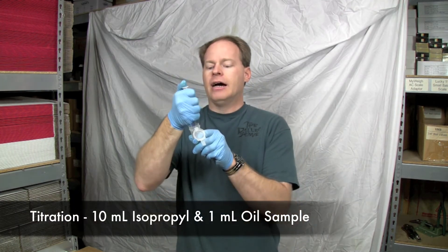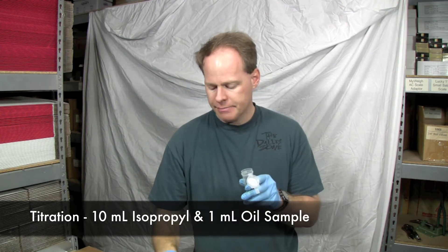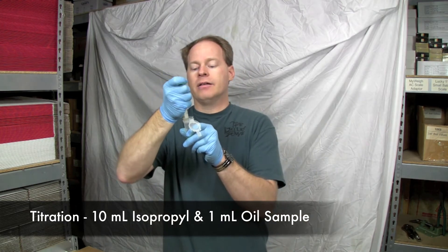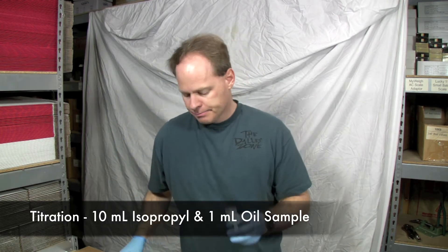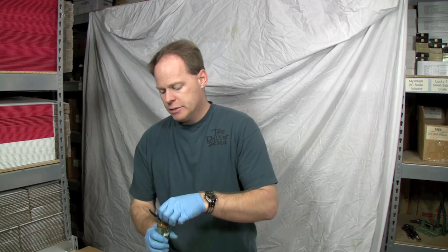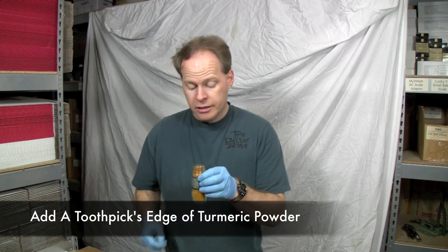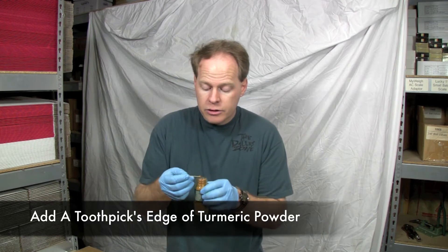Let's show you how it's done. We're going to do just a normal titration. 10 milliliters of isopropyl alcohol is going to go into my vial. Next I'm going to use a milliliter of oil. And then instead of using phenol red or phenolphthalein, I'm just going to grab some of this. You can actually just use a toothpick — you just need a couple of toothpick folds.